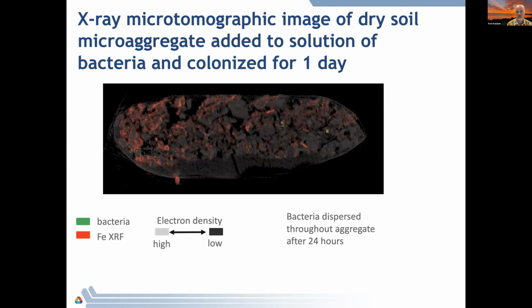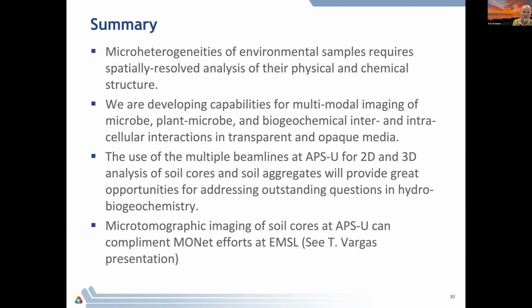And I'll end by saying that Tomas Vargas is coming up next, and I think that some of the capabilities of this very high spatial resolution tomographic imaging that I showed of soil aggregates or soil cores, and looking at the inner 1-inch diameter of an intact 3-inch core, offers a great opportunity for collaboration and working together between what the EMSL does and what the Advanced Photon Source does.